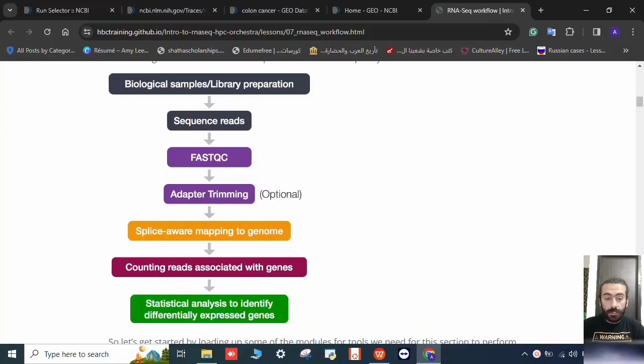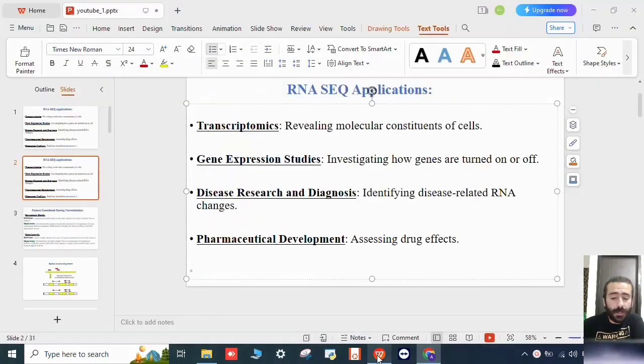In this series of videos, I'm going to speak about how to handle an RNA sample from the moment it comes out of the sequencing machine until the moment we do differential gene expression analysis. The first question that might come to our mind is: why do we need to do RNA Seq? Or what are the applications of RNA Seq? We can answer this question with 4 points.